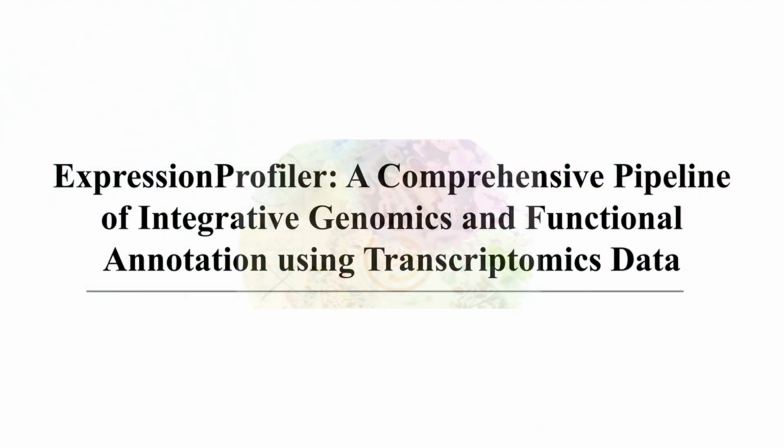Hello, everyone. Today I'm sharing with you a very interesting software or tool we developed. The name of that software or tool is the ExpressionProfiler. It's a comprehensive pipeline which uses the genomic or transcriptomic information and gives you detailed, annotated information about all those genomic and transcriptomic data and also what their functions are.